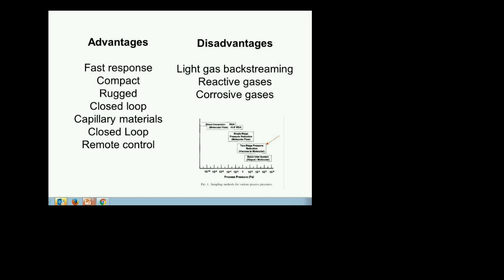Right. No, I mean, realistically, what are your choices? Is your end goal to then use the RGA to do analysis later on, to characterize those pieces, like you're trying to create a library of your gases to know later on how to identify them? Yeah. Try to catalog them and identify at what stage they individually react. Yeah. So this is why, if it were me doing it, you've got to create your library. You don't have a choice.